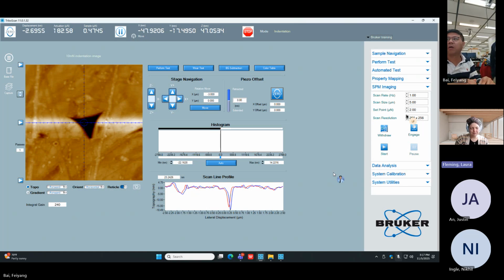Normally when we're looking at a composite material, people are polishing it down, and then scanning becomes easier, and then you can start to target those composite places. Like here, this is fused quartz, so it's very boring, but you could imagine that there was a particle here and that we moved the stage until our reticle was over that particle and then performed this indent. That's certainly possible.